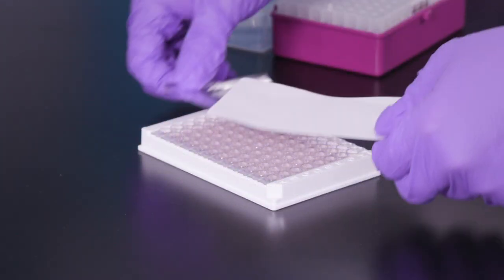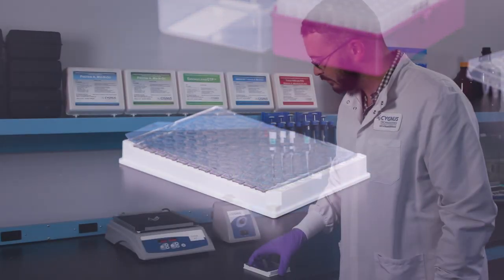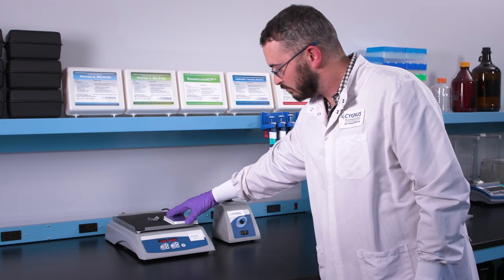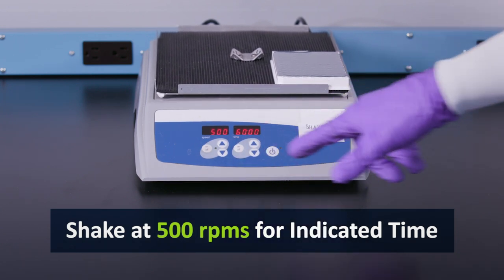For the final steps, seal the assay plate, and then shake it at 500 RPMs for the recommended period of time indicated on the assay's protocol.